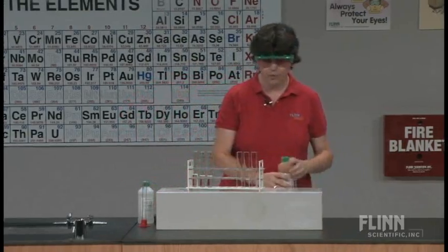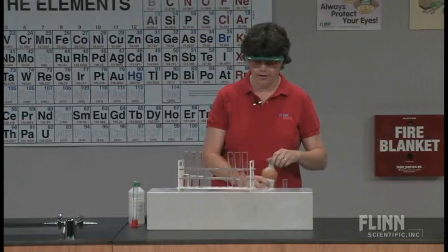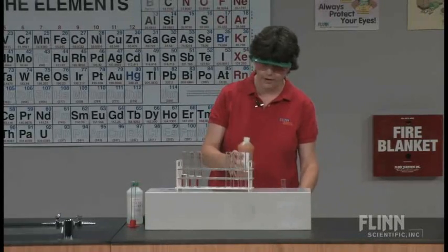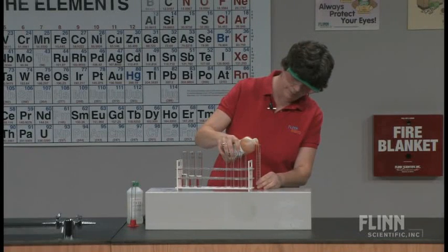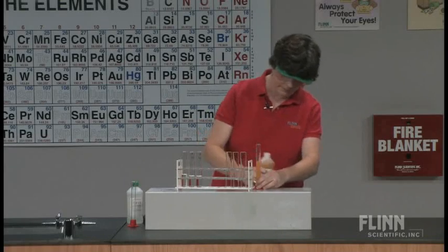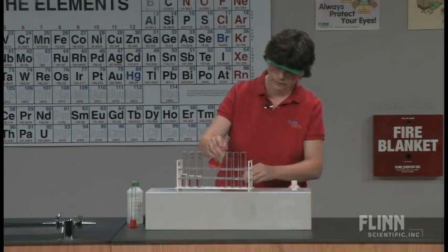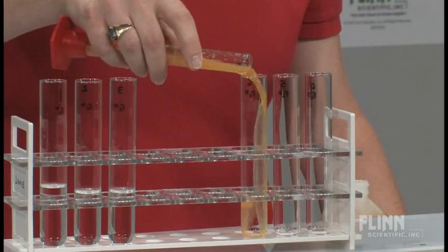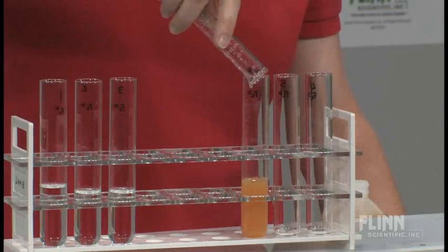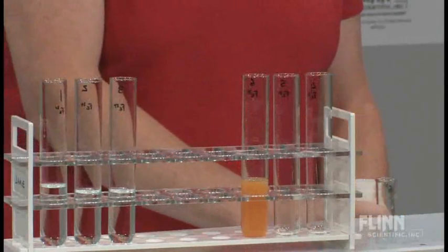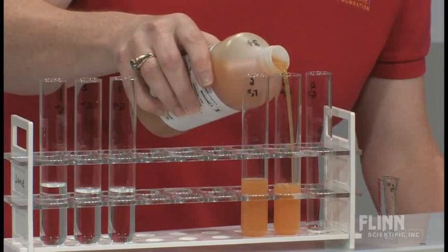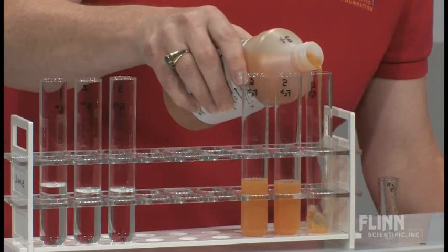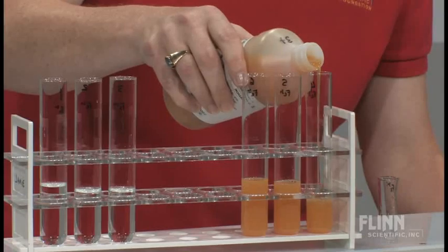On the other side I'm going to put iron three plus, or iron three sulfate, ferric sulfate, and I'm going to put about the same amount in there. And we can see that the iron three ions make kind of that rusty colored solution. Okay, we can talk about the two different oxidation states of the iron.